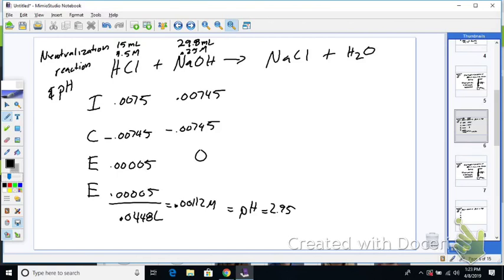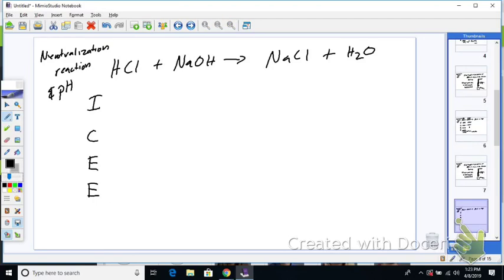Okay, so the nice thing about this is the next one is super easy. We're going to put in 30. Why are we going up by so little? That's a good question. Nolan's asking why is it you put in so much and it's going up little amounts? It's because there's lots and lots of H pluses in there that need to be neutralized. So even if we get really, really close to neutralization, there's still lots of moles of hydrogen ions in there until you get to neutral.